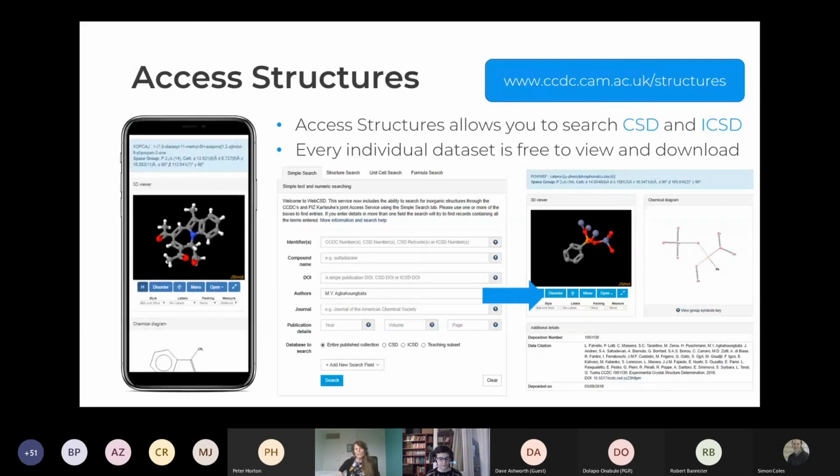If you don't have Conquest installed on your desktop or laptop, but you want to explore the structural data, we also have web interfaces. So Access Structures is a free service that you can access via this link here that allows you to view and retrieve every entry in the Cambridge Structural Database or the inorganic database. And every entry is free to view and download. If you want to do more advanced searching, then we've got WebCSD for licensed users, and that's got some of the same search functionality as Conquest that we've just seen. It's just not quite as in-depth at the moment.